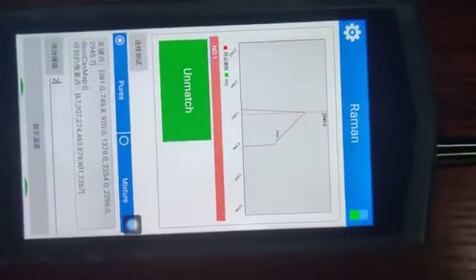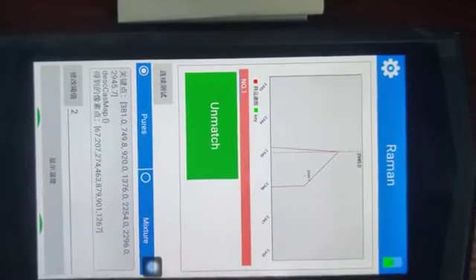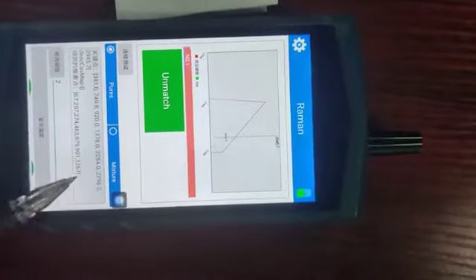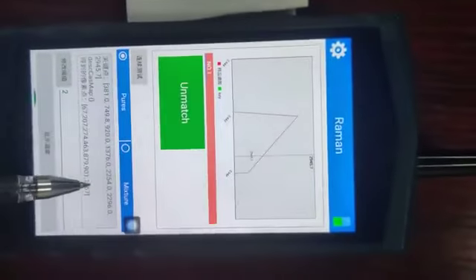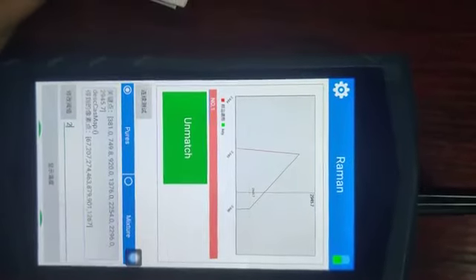So it's larger. You need to minus 1. That means you need to make 2945 into 2944. So it's needed to minus 1, 1267 minus 1. That means 1266. Okay, that is the pixel.